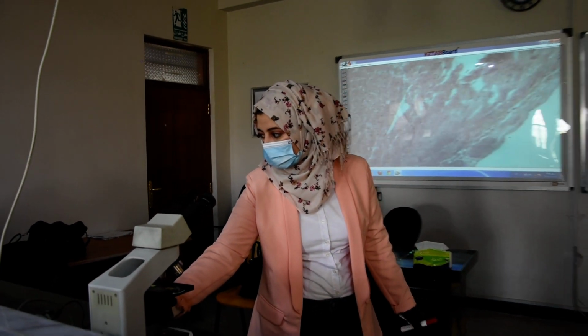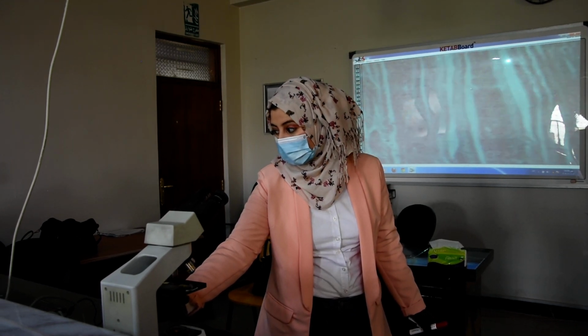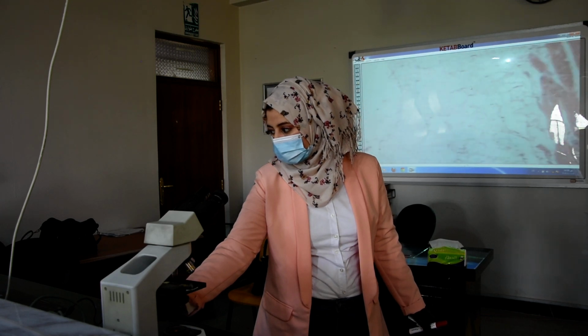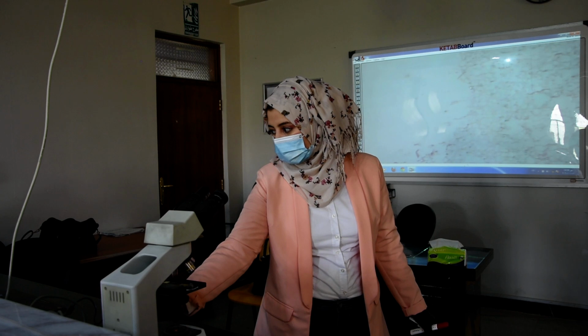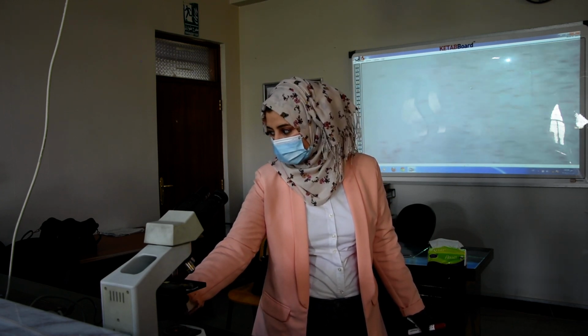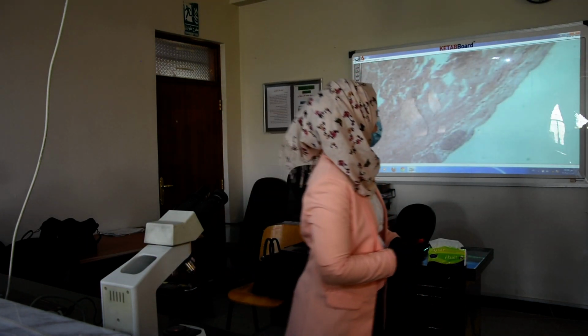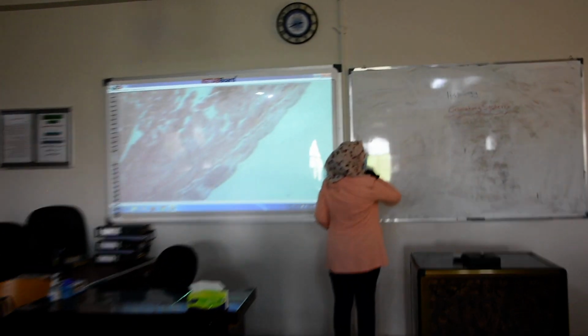All these are myocardium. It's a classical striated cardiac muscle. And the last part is the epicardium, or called visceral pericardium. Okay. I can make you a simple diagram to show the layers and details.